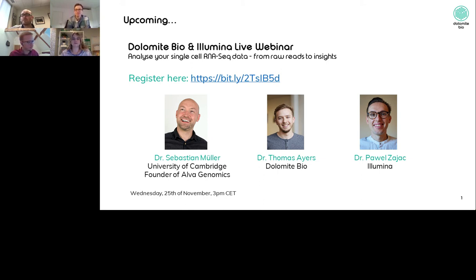Because I've worked on single cell data for quite many years now, and in the old days you couldn't really overcome these batch effects. Some of the batch effects were horrific, and there were lots of computational strategies to minimize and get over this. But ultimately, a batch correction is a fudge. It's sometimes a necessary fudge, but if you can run your samples in parallel, that gives you a lot more. They're not confounded, essentially.